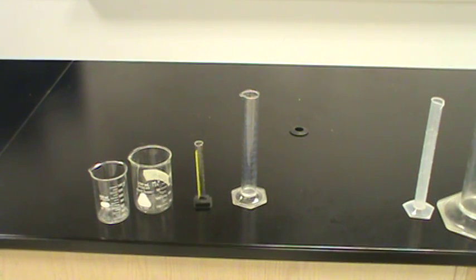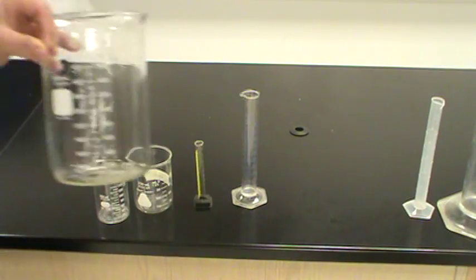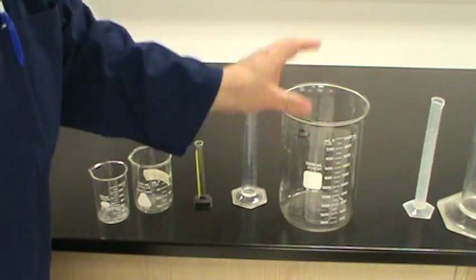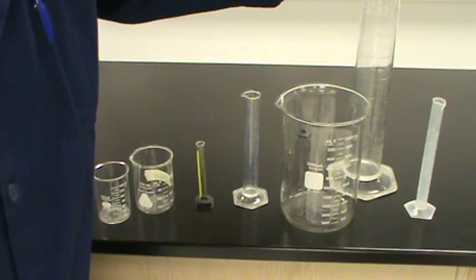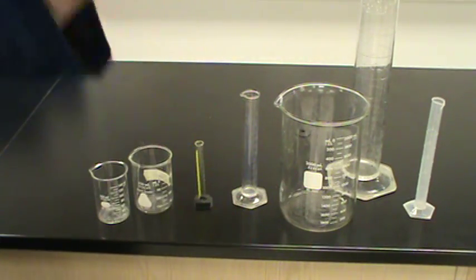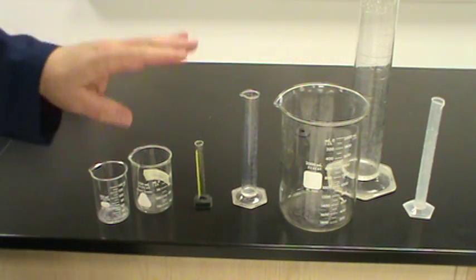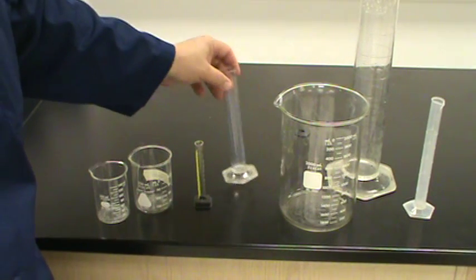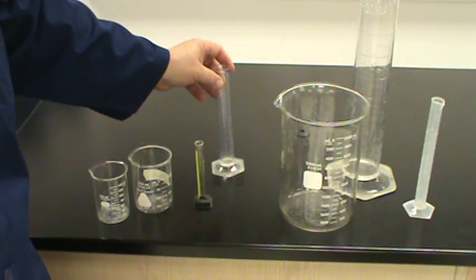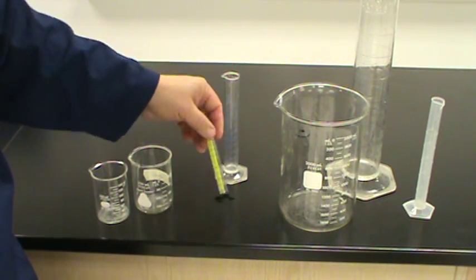And one of the things that we want you to understand in science is that looks can be deceiving. So please make sure and trust that your measuring instruments are exactly what they're supposed to be and that you don't have to adjust them.